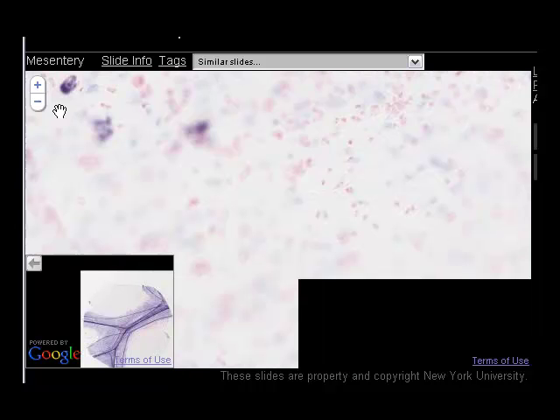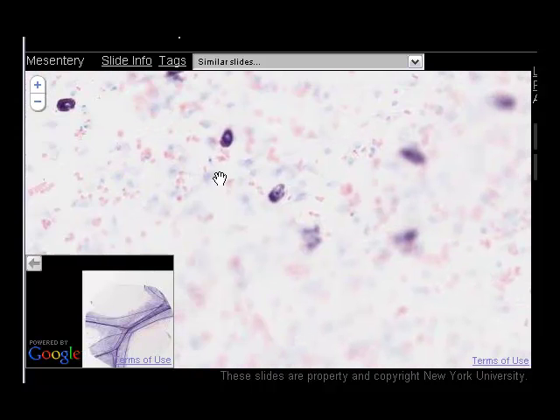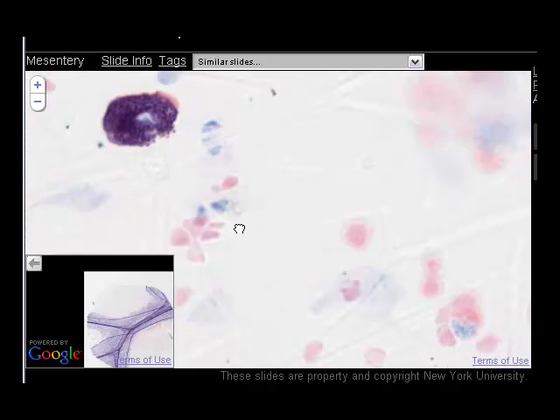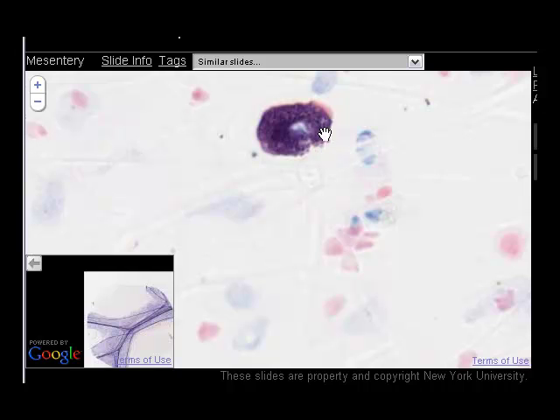Maybe reduce in magnification a little bit. Some of which are fairly clear and can be seen in focus. And this is a good example of one here, these are either macrophages or mast cells which you find migrating throughout the connective tissue. As I said, the stain that's used here doesn't allow us to see the connective tissue fibers, but they appear as almost a negative impression, which you can see here, some collagen fibers.